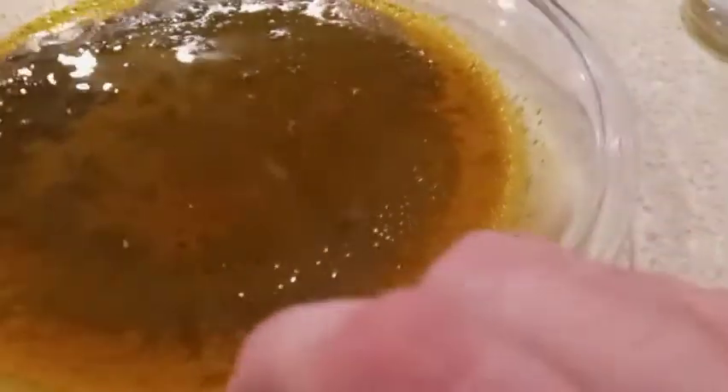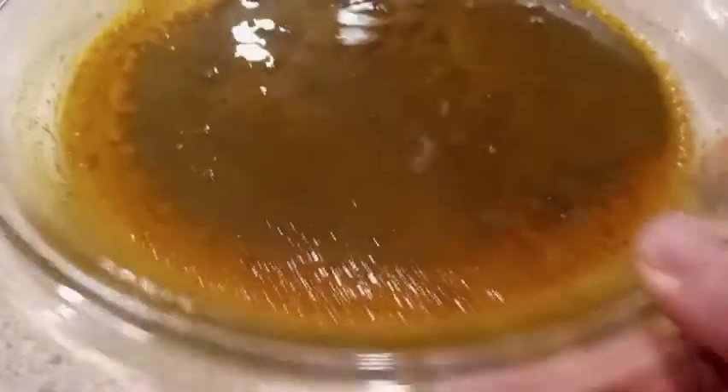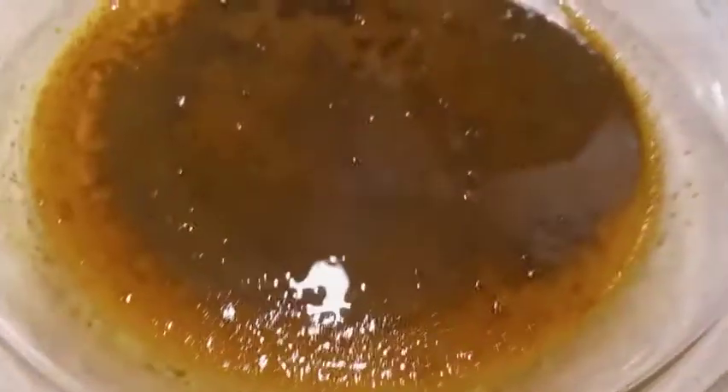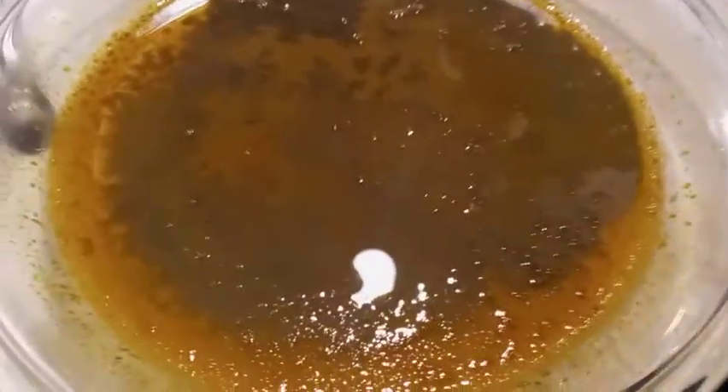It doesn't really move super fast — kind of does, but not as fast as if it were just water or alcohol. There's a lot of oil dissolved in it right now. You can see a lot of dark spots underneath which are crops of piperine crystals. I could filter those off and try them, but I'm not going to — I'm going to redissolve everything.